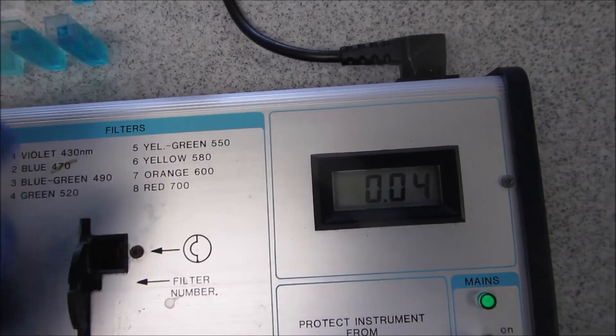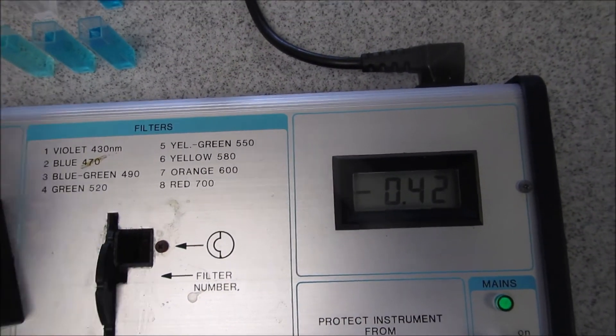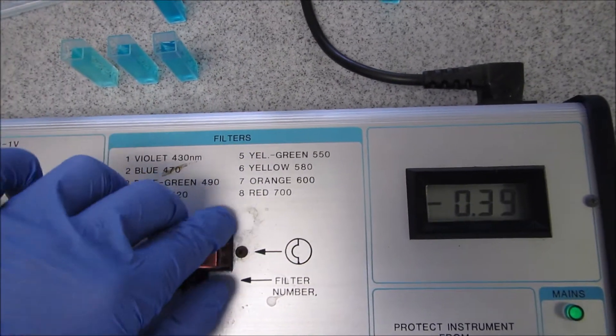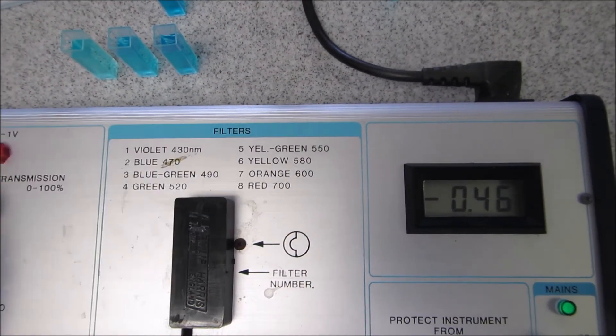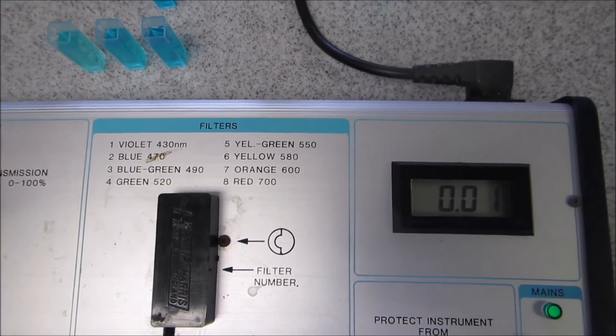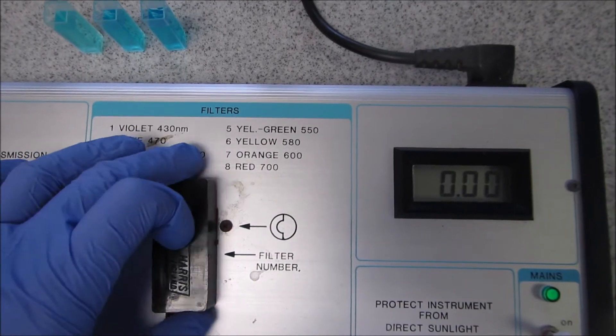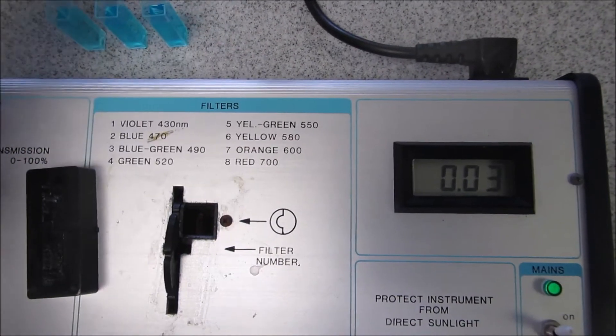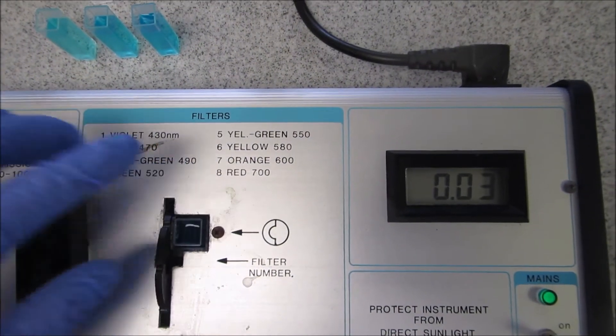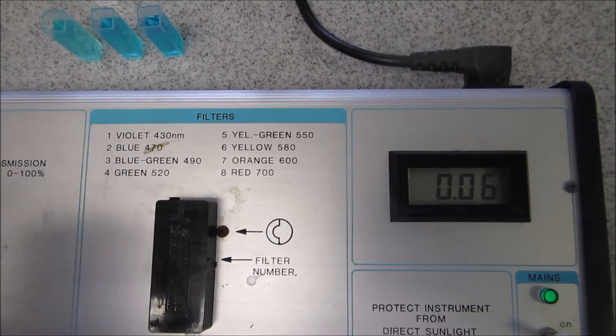I'm going to take it out, move it to the third one which is 490 nanometers, put in my blank and zero it. This is to find basically where the maximum absorbance is, because this is the wavelength that we want to use for all of our measurements.